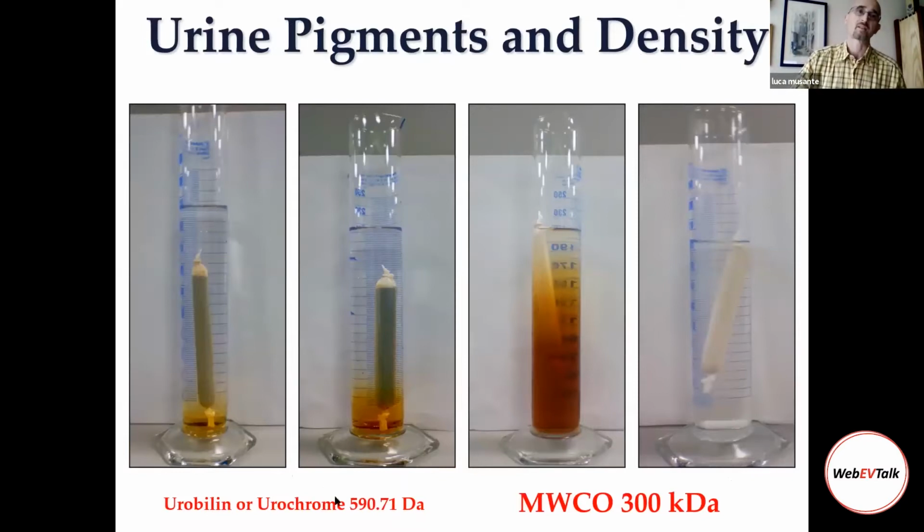So, as I said, it is a small molecule, less than 600 Dalton, so it should be quite easy to get rid of it by simple dialysis by diffusion. So in this experiment, we wanted to know what was the molecular weight cutoff that can let the yellow pigment diffuse into solution.